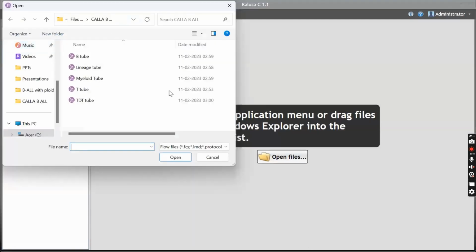In this case, I will show you the importance of CD66 and CD11b. CD66C is basically a myeloid marker. 66C is very useful during immunophenotyping of AML because 66C and 15 will help you to exclude the neutrophils, because the mature myeloid population, from myelocytes, metamyelocytes, band cells and neutrophils, will express CD66C and 15.